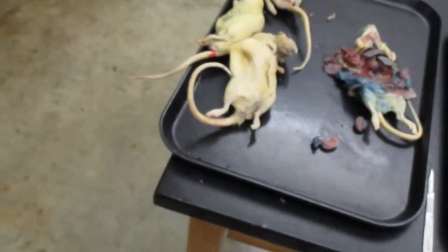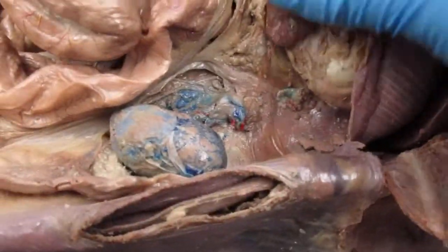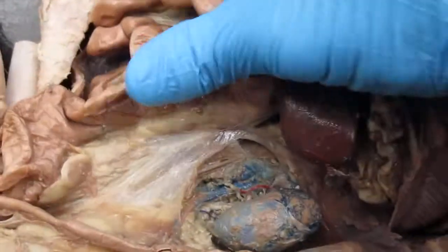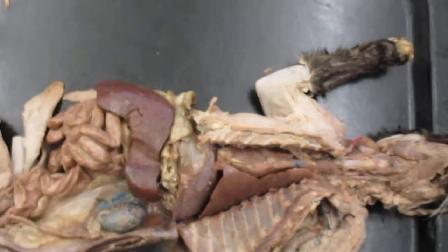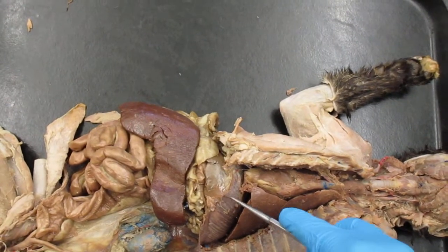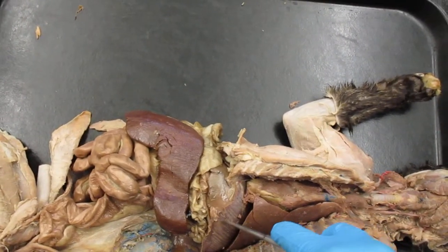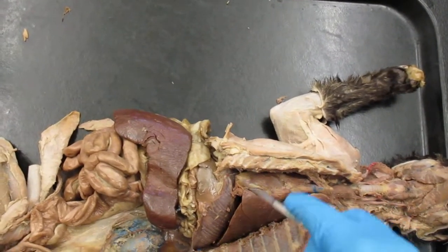Next, let's do the adrenal gland. So, let me show the adrenal gland here. So, if you look in the abdominal pelvic cavity, so you can see the cat right here. You see the thoracic cavity right here. You see your diaphragm muscle, which separates your thoracic cavity from your abdominal pelvic cavity.